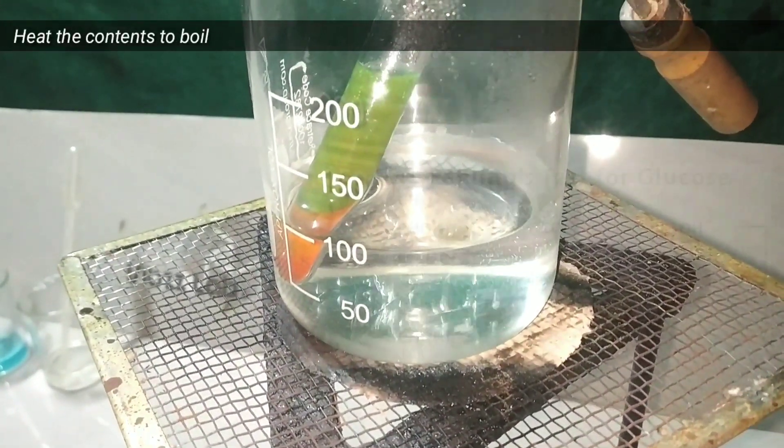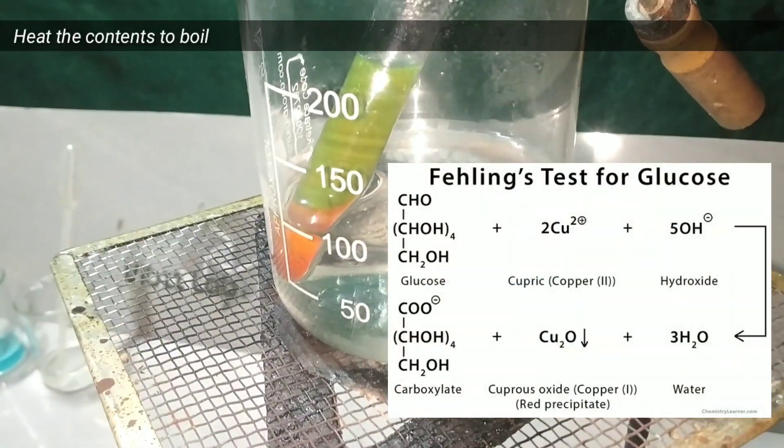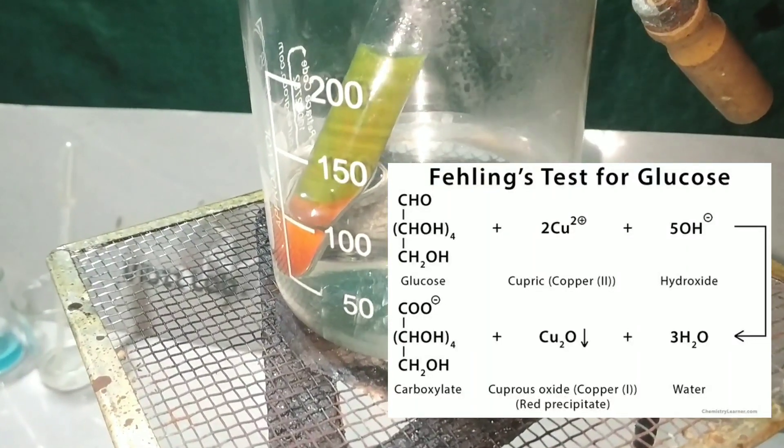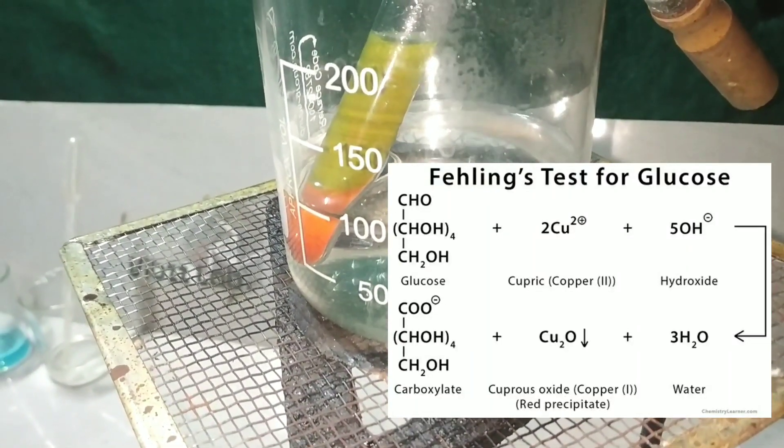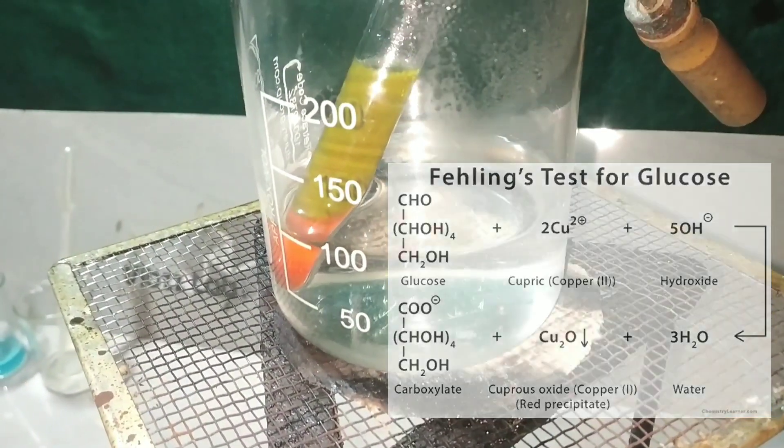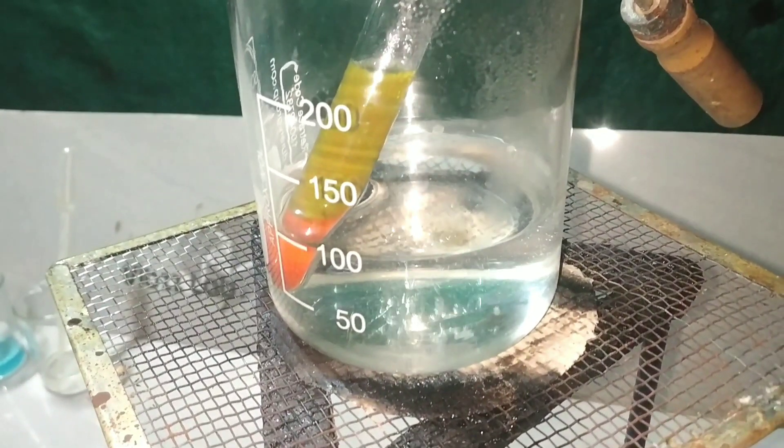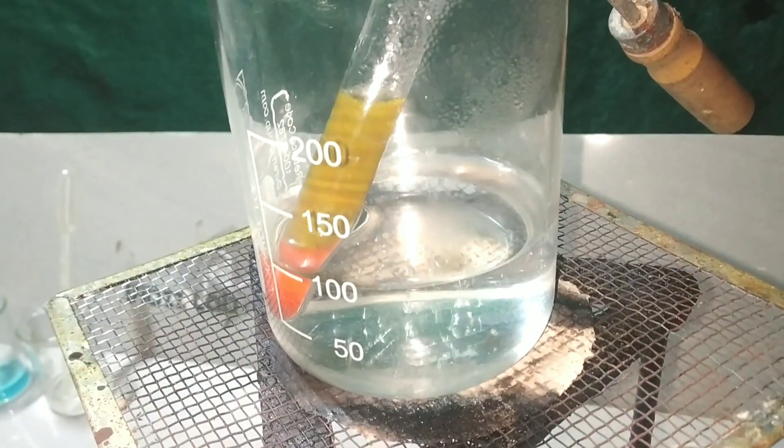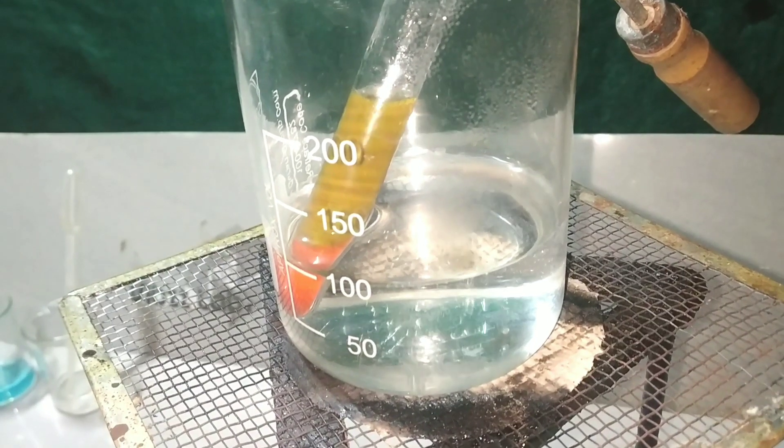Now we place the test tube in boiling water bath for few minutes and immediately you see a color change which is similar to the Benedict's test. The Bis-Tartarito-Cuprate-2 complex is an oxidizing agent which oxidizes glucose to gluconic acid and itself gets reduced to copper oxide.